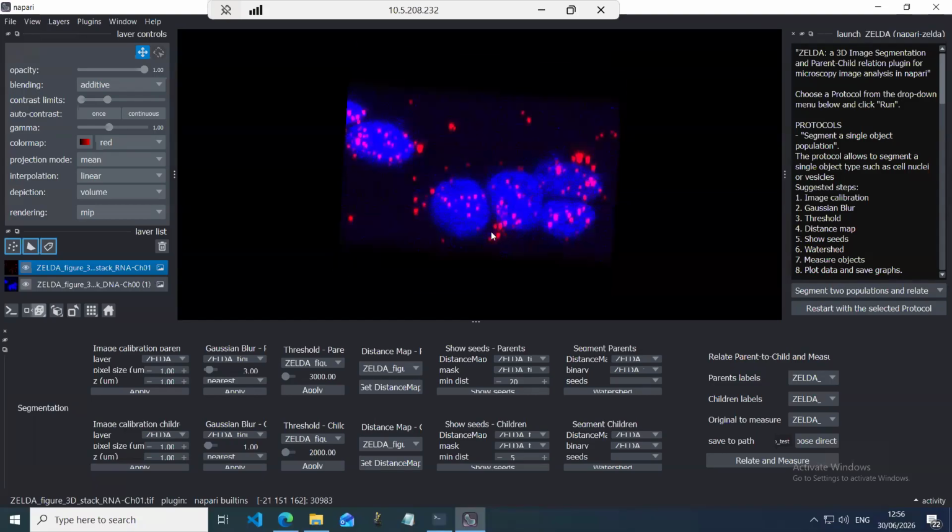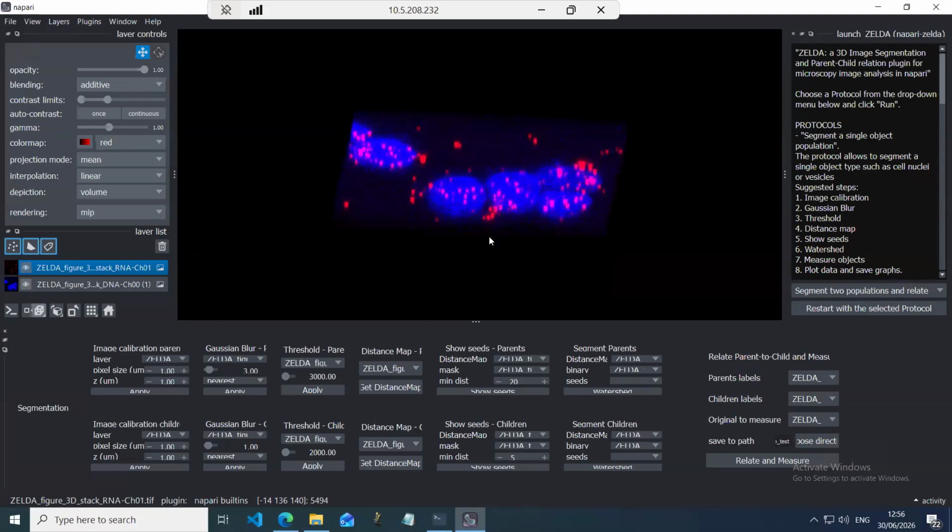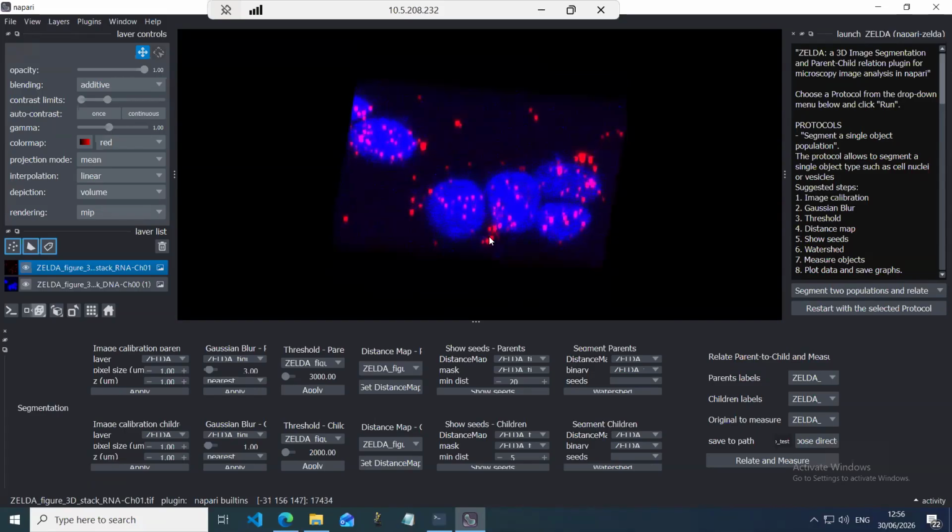3D. So in this case, you see the data set appears to be quite flat. It is indeed quite flat. However, it is also a feature of the software that it will load the data set with a non-specific scaling. There will be a scaling that is 1, 1, 1 for all the three spatial dimensions. So the first part of the workflow is to rescale the dataset in order to insert the correct voxel size.